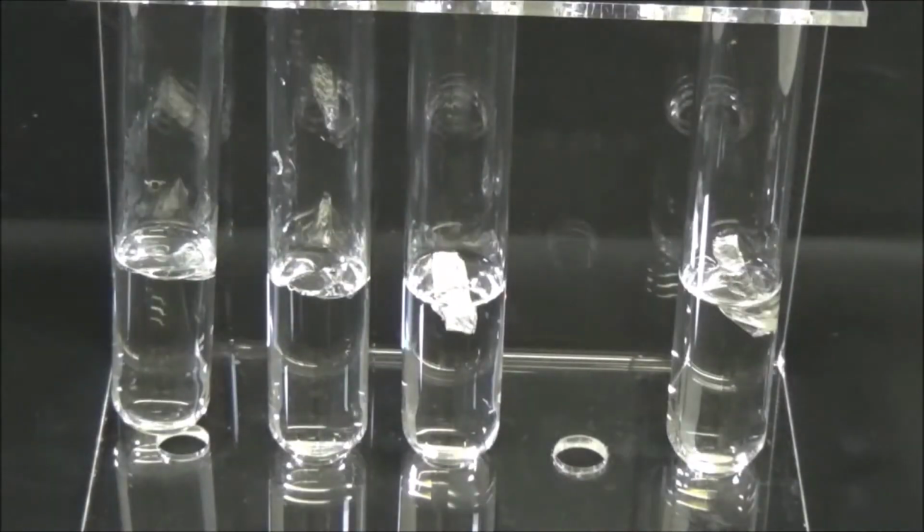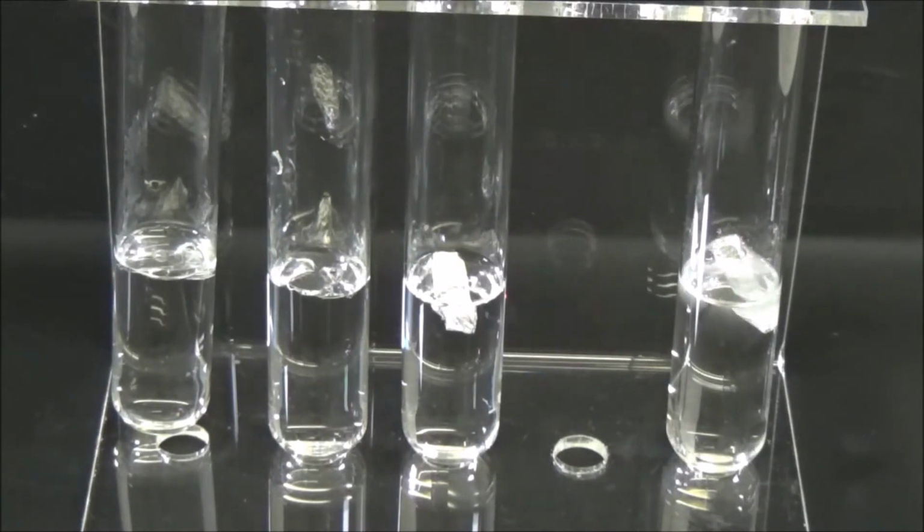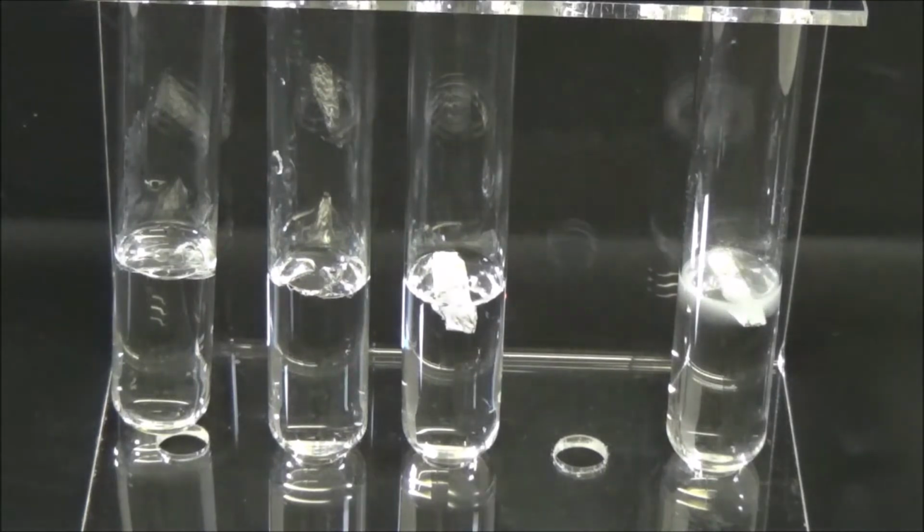In a second step, a double-folded strip of aluminum foil measuring 4 by 2 cm is placed in the same row of samples. Although not significantly more noble, aluminum exhibits a completely different behavior. Diluted acids cannot harm the metal, but caustic soda attacks it.